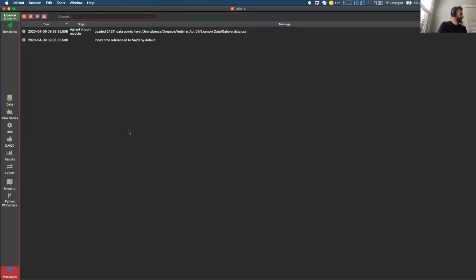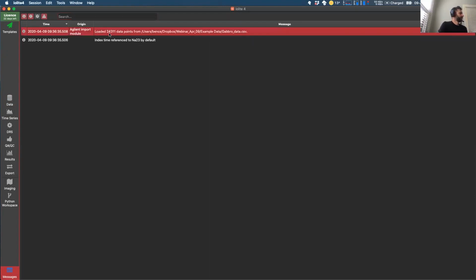If we click on this here, anytime something about your session has changed, it will log a message here. So it's told us that it's loaded 24,000 data points from this file here. And as we go through our session, it will keep adding messages here so that we know anytime we've changed our session. The only time it doesn't log something here is when you make manual selections, but otherwise there'll be a value here. And you can export this with your experiment so you can keep a clear track of what's happened during your experiment.